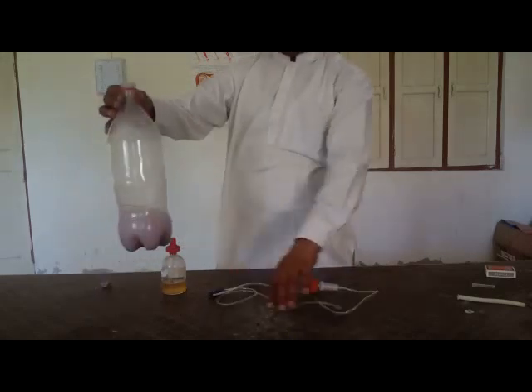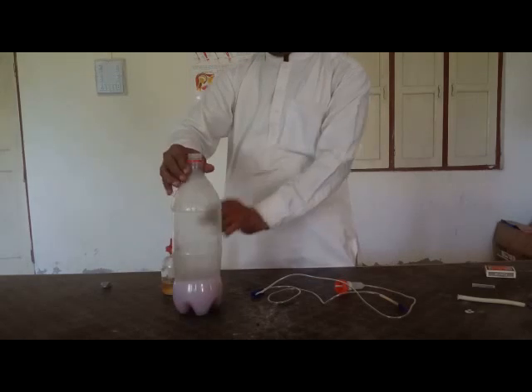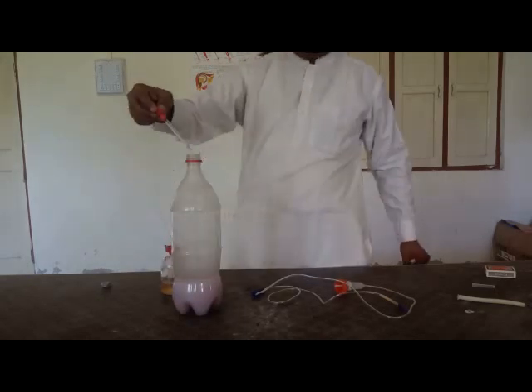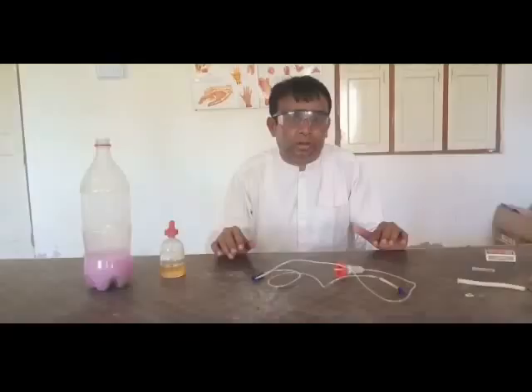And there's calcium hydroxide. So if there's calcium hydroxide in it, the phenolphthalein will change its color. Now look at it. Pink color.